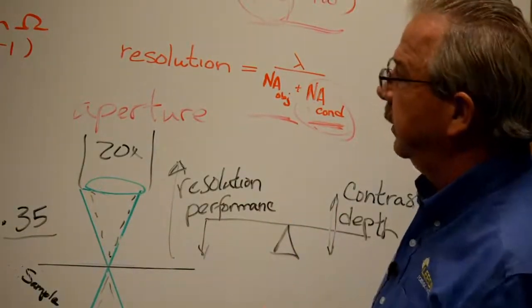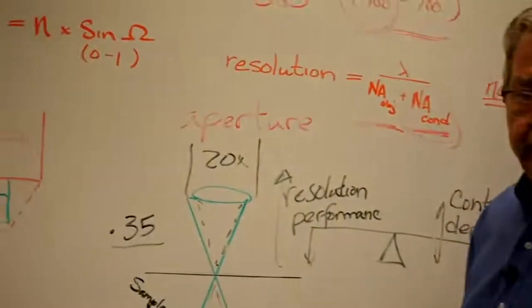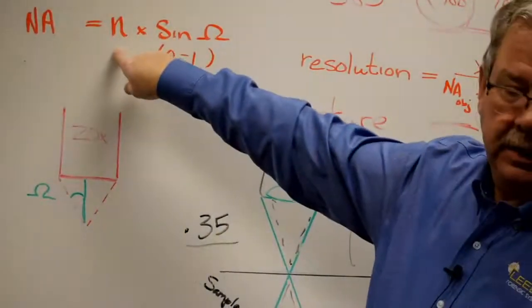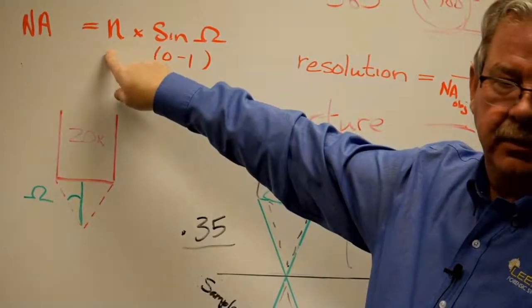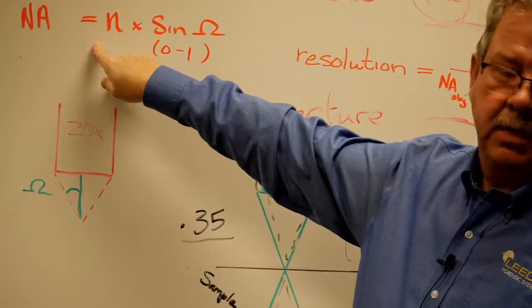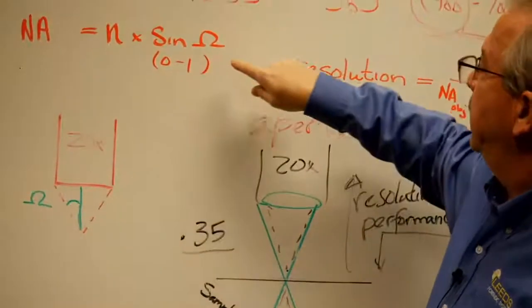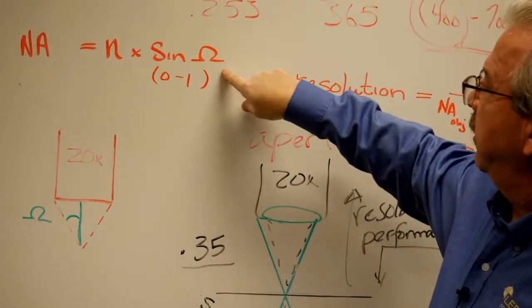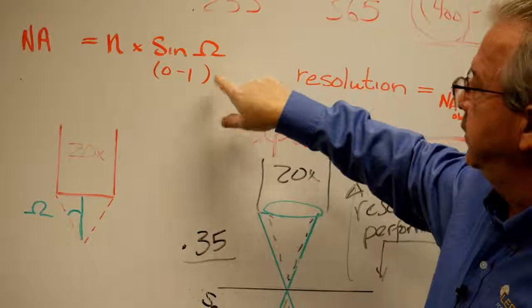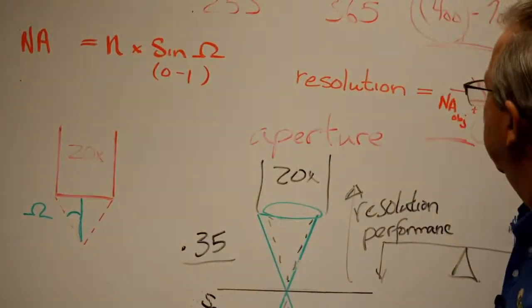What am I learning here? Well, you taught me what numerical aperture was, hopefully. And we've learned that some objectives can be designed to look through a media. In the case, again, for forensics, we're almost always going to be doing everything dry. And that numerical aperture is a statement of the sine function of the objective, or the angle of the light that it can capture.